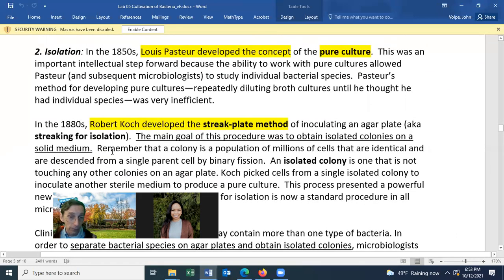And if you go through 2 isolated colonies before you set up your bacteria to grow it up, then we say with a good chance you have a pure culture. And the chance will be greater than 95% that you have a pure culture.